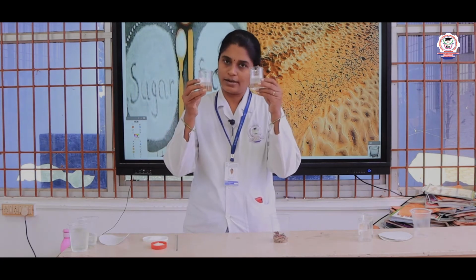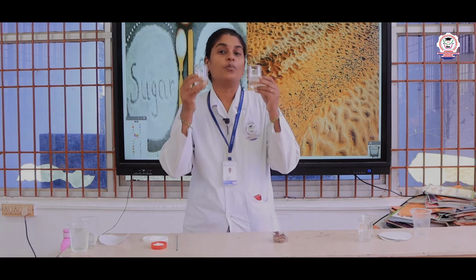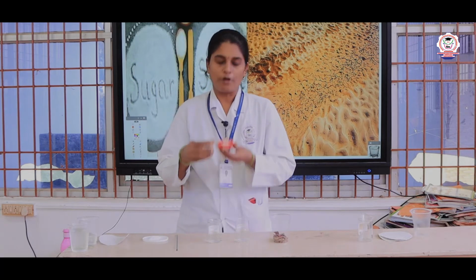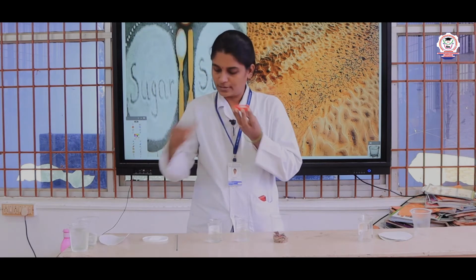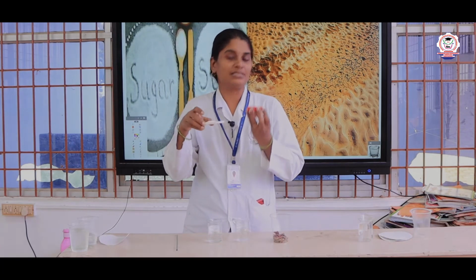Now, I have two beakers, and in these beakers I have water. Now I am going to show you what the soluble impurities are. First I am taking a spoon of sugar, and I also have salt. Now I am going to mix this salt and sugar in water. Let us see whether the sugar and the salt are soluble in water.